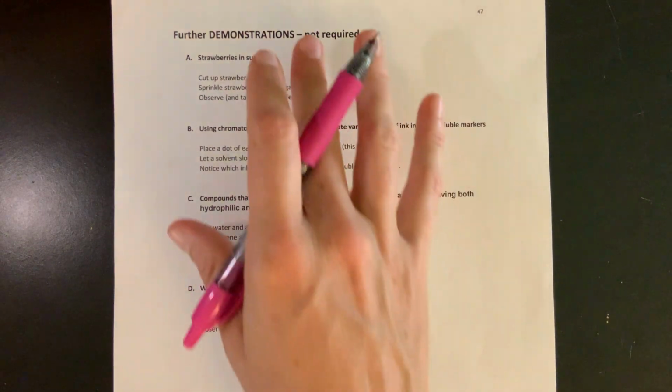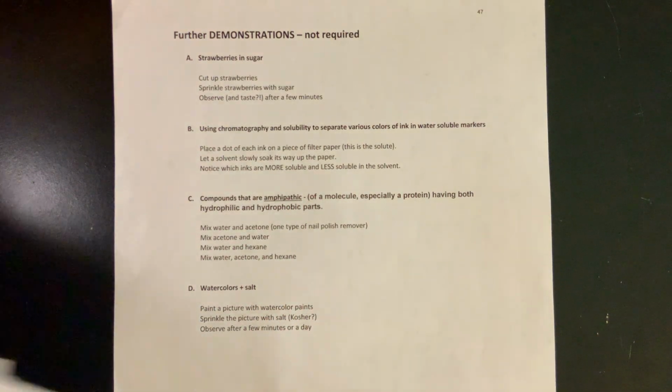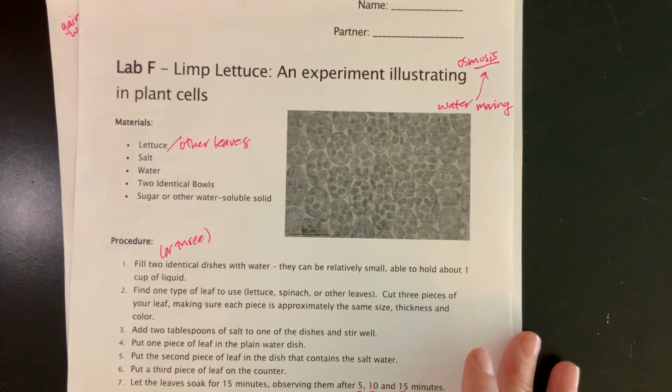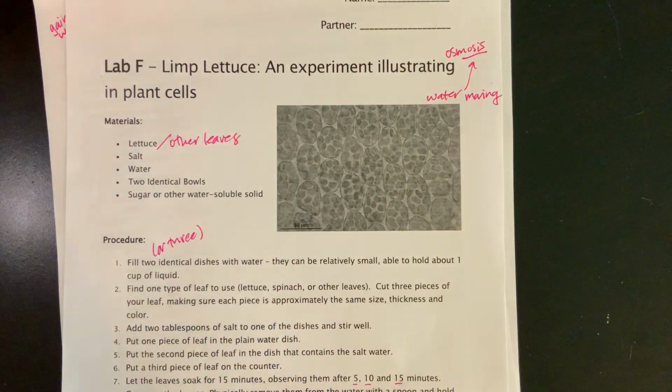And there's nothing you need to do here. These are just some other demonstrations that go with this osmosis concept. So you will be working with lettuce or some other leaf of your choice to look at osmosis, which is water moving into those cells or is water moving out of those cells?